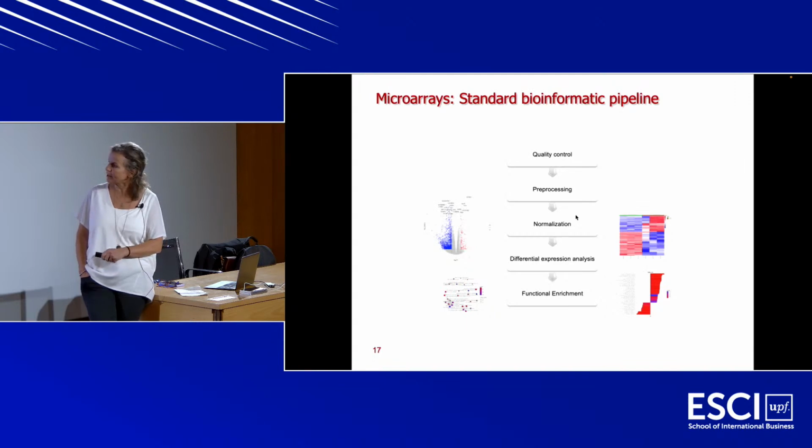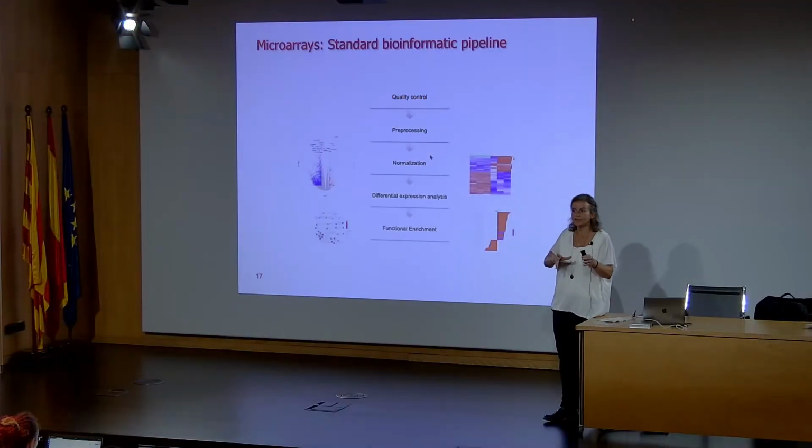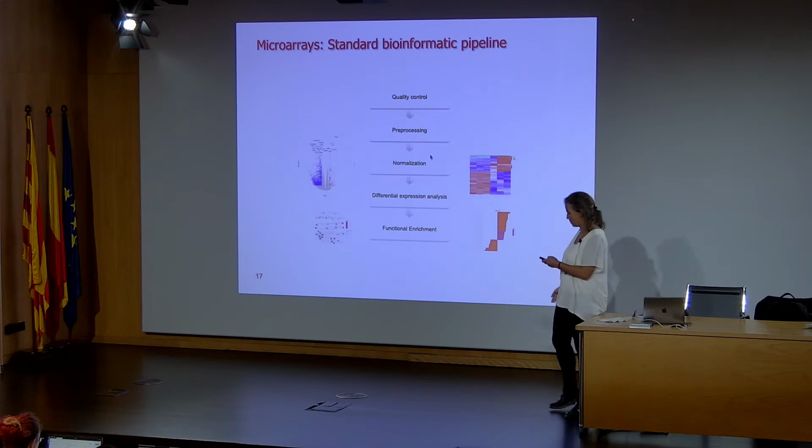And finally, after the differential expression analysis, what we usually do is to perform functional analysis. And that is what I was commenting at the beginning, that beyond the gene analysis is a function analysis. So we are interested in what is the enrichment? What are those genes doing in the biology? Are they migrating? Are the cells dying? What is happening? So this is what we do in the functional enrichment, and we have specific bioinformatic tools to do that. We work basically with R and Python.